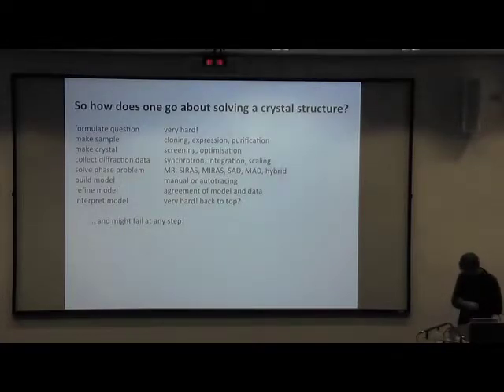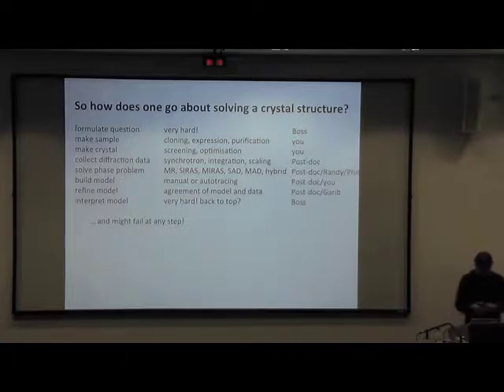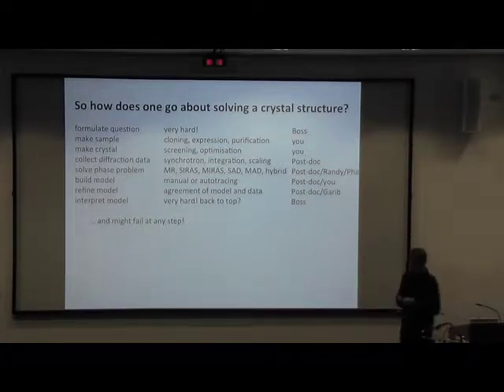But this is what I took from Jan Leuven's talk from last week. These are the different steps that you'll have to go through and that will be discussed throughout this course. And one thing I really want to emphasize is that most of your work will be actually this. All right, so you come to the project, they tell you go work on that protein, and you think, fine.